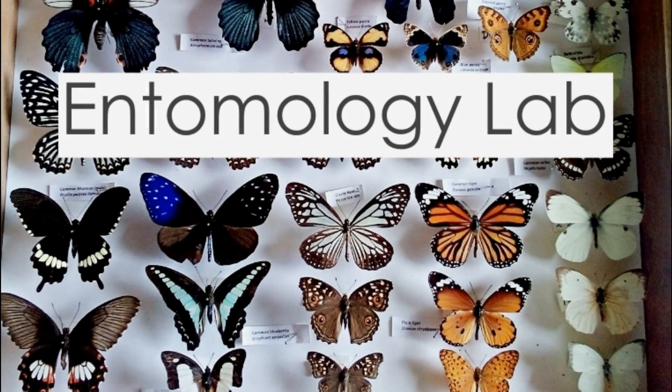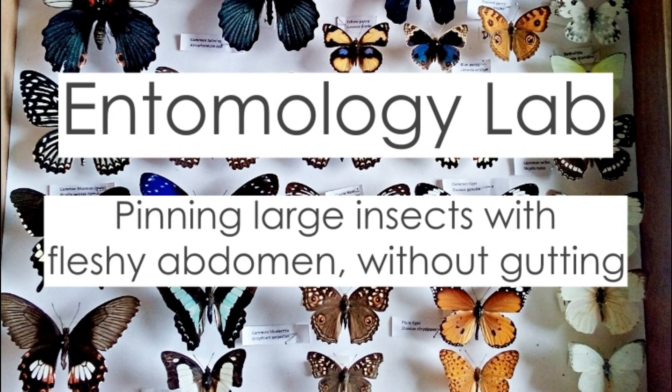Hello and welcome back to another episode on the subject of practical entomology. In today's video, we'll be taking a look at how to pin and spread an insect specimen that is fairly large in size and with a rather fleshy or bulky abdomen, without the need to actually go through the time-consuming process of making incisions and gutting the insect. For this, we'll be using a giant false-leaf katydid as an example specimen.